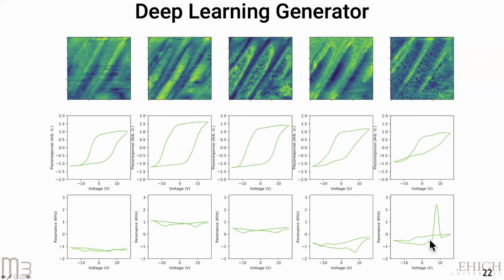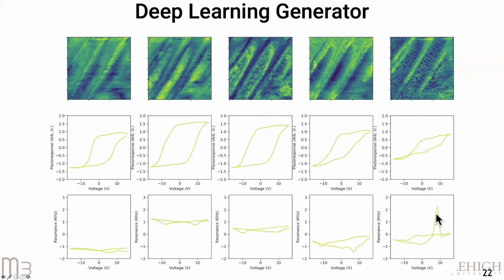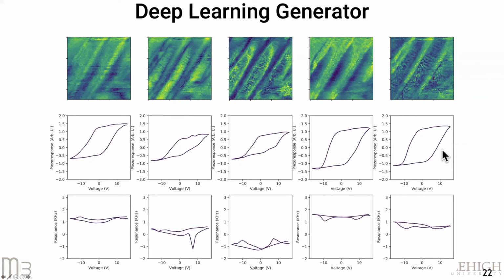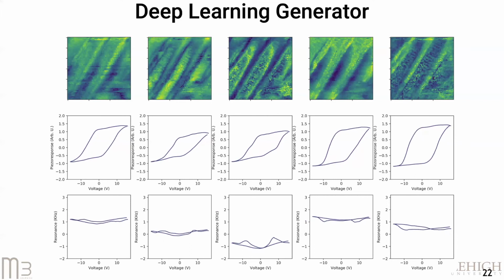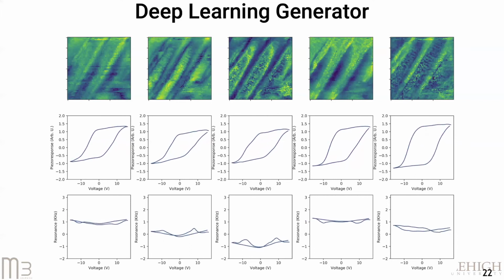And here on the right-hand side, we have this strong positive value, which is associated with a strong negative concavity. So what this shows is that the deep learning model is able to much better represent the key small structural features in the spectra that are important physically to analyze and understand.